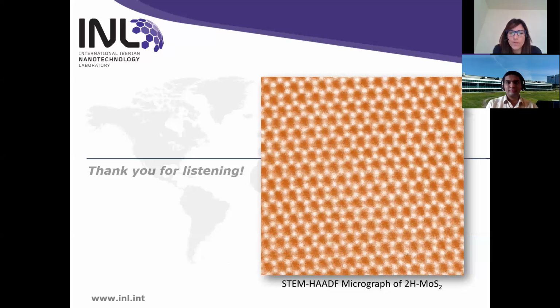We have a comment from Oliver, part of the IME's facility: one can embed soft materials like cells into a resin and stain them to provide enough contrast. There's FIB-SEM slice and view of biological materials. Okay, thank you very much, Oliver.